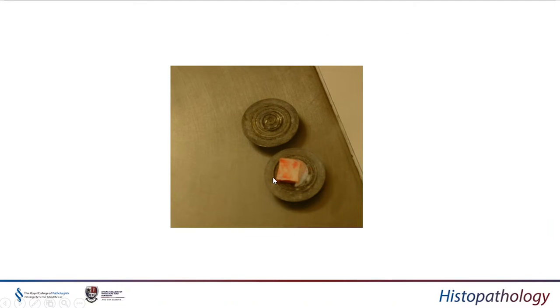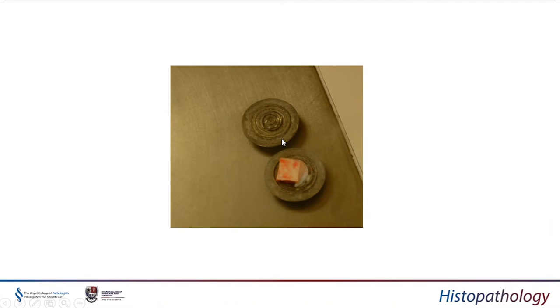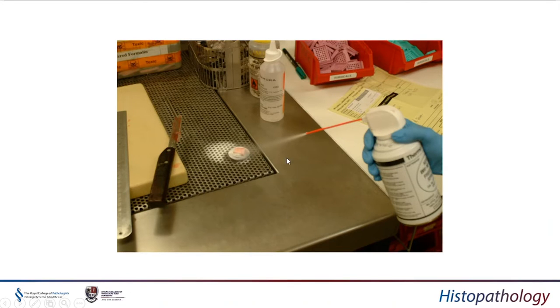Here we have a frozen section block taken from this lesion — about the size of a thumbnail, roughly a centimetre or so in size and a couple of millimetres thick. It must not overhang the cryostat chuck; it should be within the central area. If it's too big or has variable tissue such as fatty and firm, or necrotic and firm, it will freeze at differential rates and be difficult to cut. Once the block is taken and put on a mountant such as OCT, which binds the section to the chuck, it can be frozen — in this case using a spray freeze.